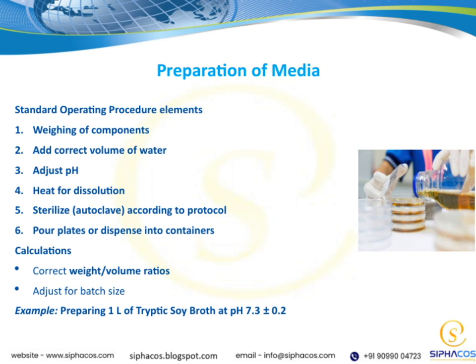Once everything is dissolved, the mixture must be sterilized, typically using an autoclave, following the specific protocol to ensure safety and consistency. After sterilization, we pour the media into plates or dispense it into containers, depending on the intended use. Throughout this process, calculations are vital, making sure we have the correct weight-to-volume ratios. We also need to adjust our calculations for the batch size we're preparing, whether it's a small or large volume.